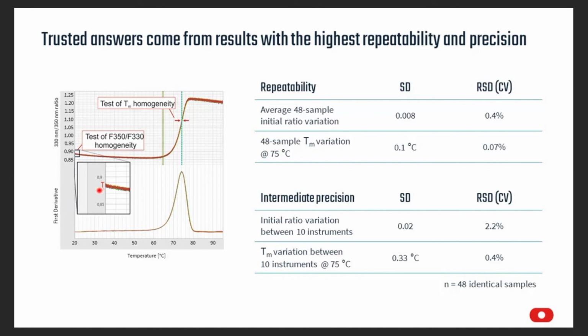One additional part of this repeatability, accuracy, and precision is also the intermediate precision, or the precision between different instruments. So let's say that instead of just one lab working with an instrument, you are part of a group that has to work with other collaborators who are either upstream or downstream from you in the workflow of developing a biologic, or you might have external partners at a CRO or another company that you are collaborating with on the development of a molecule.